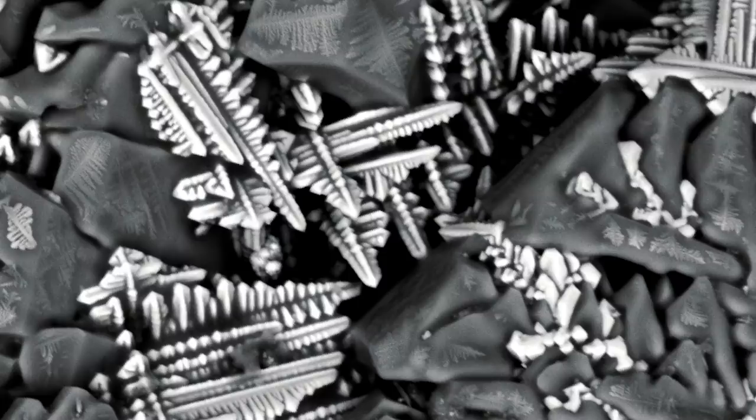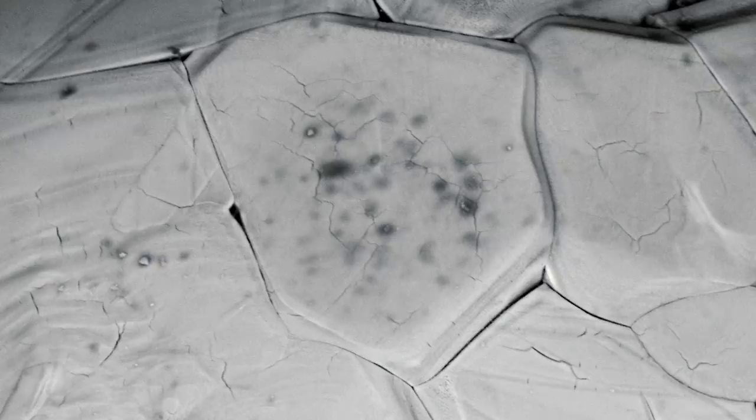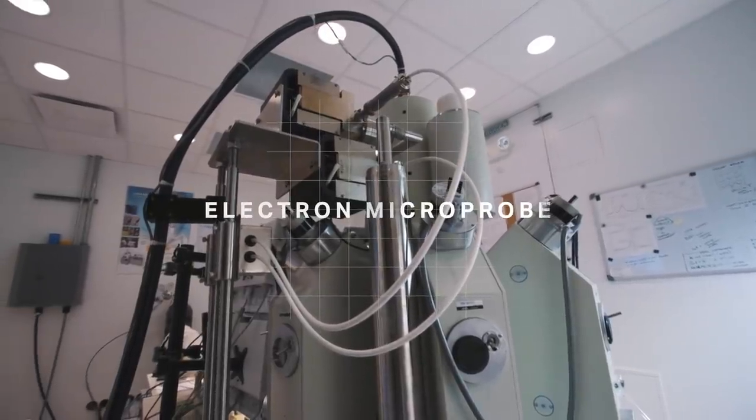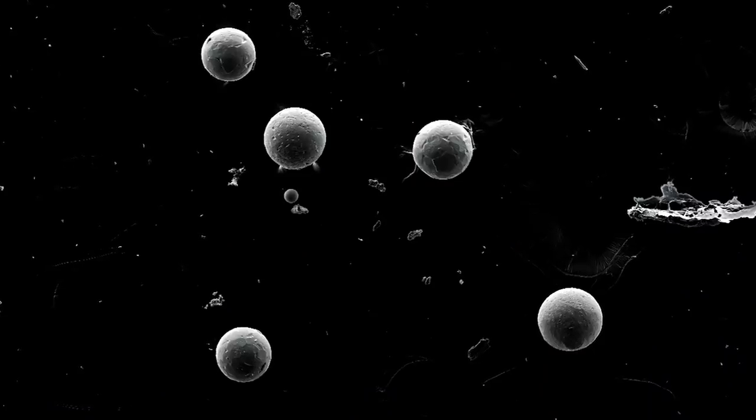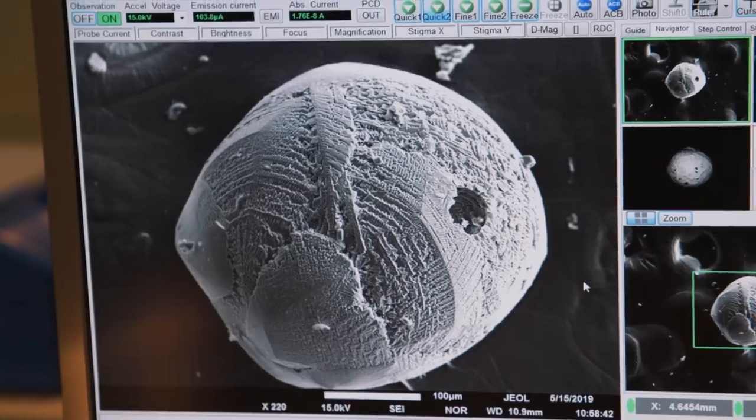What you're looking at are tiny bits of rock and metal under a device called an electron microprobe. The samples came from a rooftop in Brooklyn, but they might have traveled quite a ways to get there, possibly from outer space.